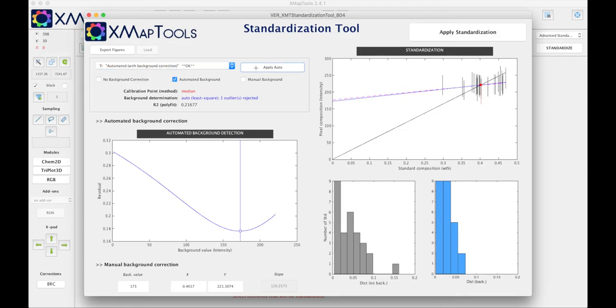And titanium, we can define a background correction and press auto. This example is really nice because we can see what would be the difference between the old method, the black calibration curve, and the new method, the blue calibration curve.